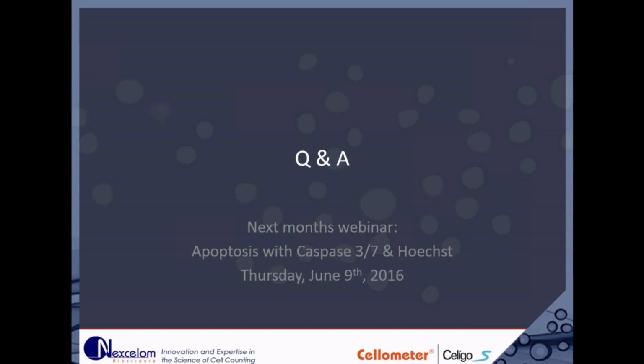All right. So the next question is saying that they noticed you did not scan the wells on the edge of the plate, both the top and the bottom, on the rows and the columns. Is this due to an instrument limitation? It's not. I just chose to minimize my data set on this plate.